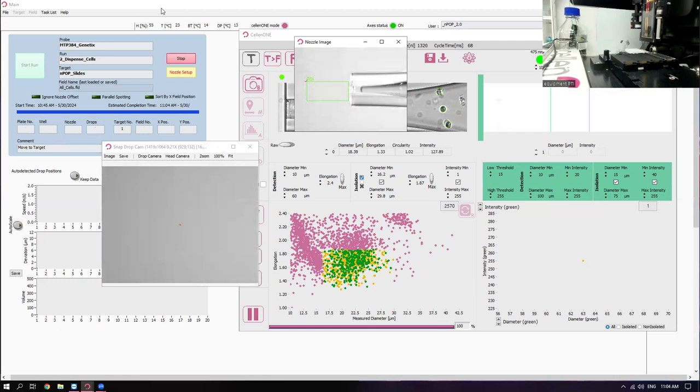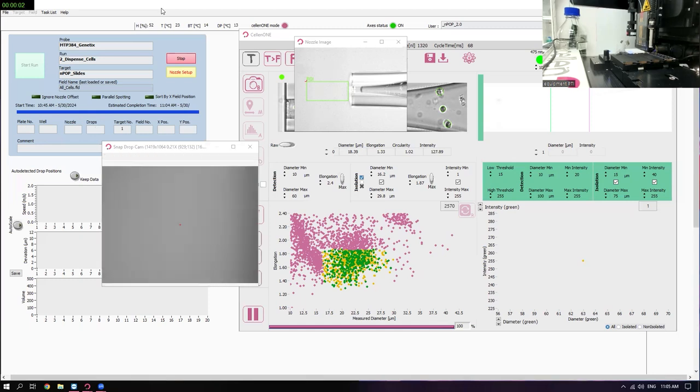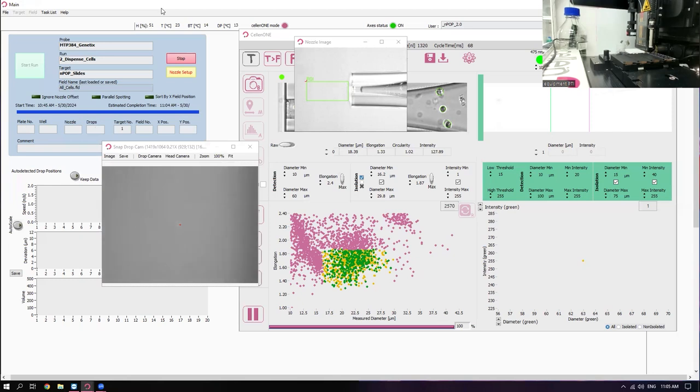So if you're handling a smaller particle, essentially you have very small particles. It's a pretty well laminar flow in the tip of the nozzle, but there are locations where small particles can get stuck in little vortices and they don't flow as uniformly. And so if you have a large nozzle or a medium nozzle, instead of being 95%+ single bacteria, for instance, you'll be 80-85% single bacteria, and those other wells will be empty. Maybe because of the diameter also increasing the focal plane where you need to be able to detect stuff. So you're bringing everything closer to that focal plane, and you're essentially creating a more robust laminar flow, which gives you the ability to do that. And then the larger size nozzles are better for samples with larger cells and aggregates.